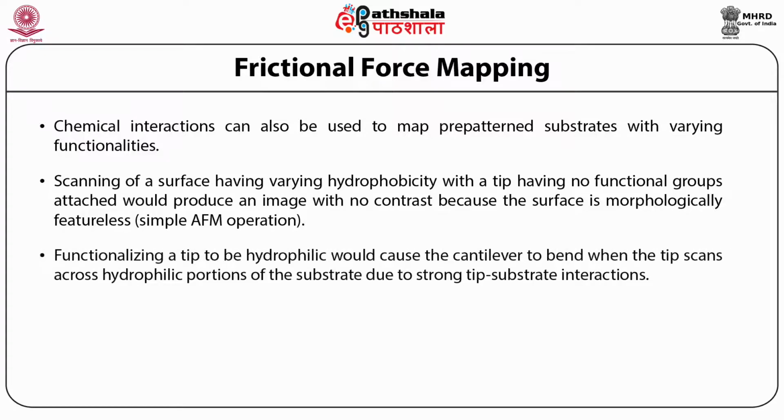Functionalizing a tip to be hydrophilic would cause the cantilever to bend when the tip scans across hydrophilic portions of the substrate due to strong tip-substrate interaction. This is detected by laser deflection in a position-sensitive detector, therefore producing a chemical profile image of the surface.